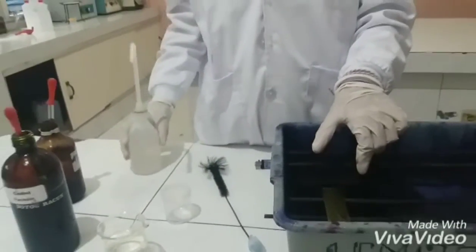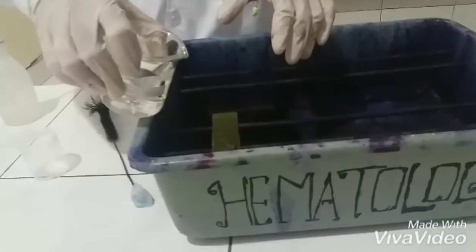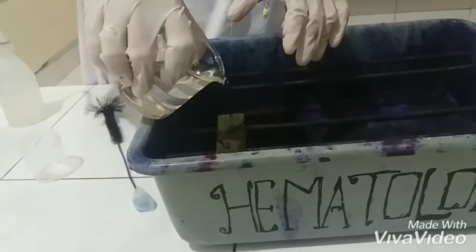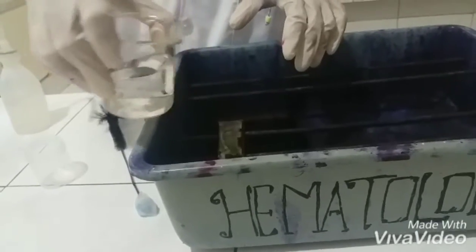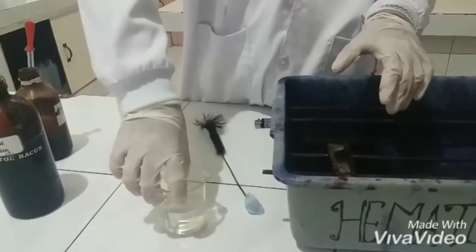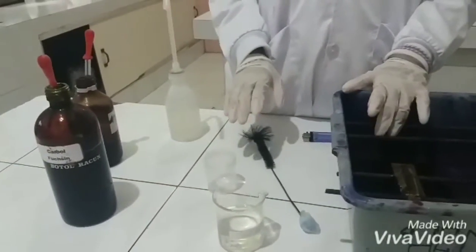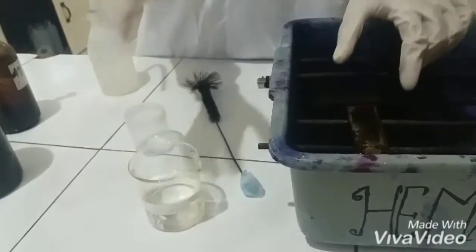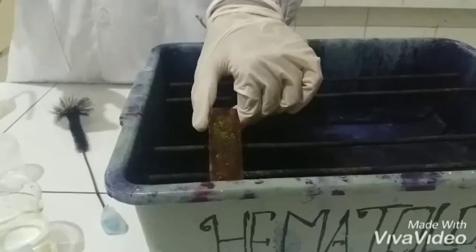And then we add acid alcohol, just 30 seconds. And then we rinse with water again.